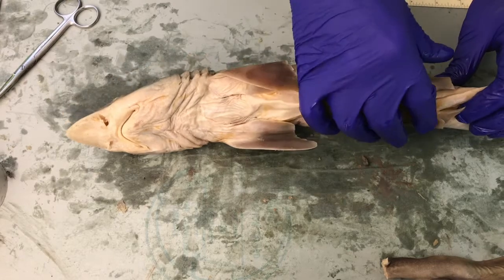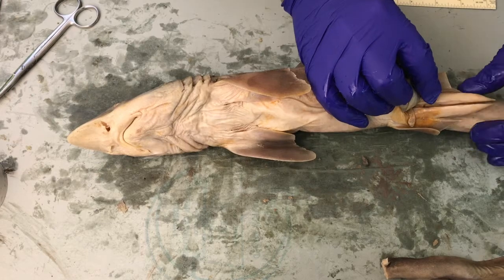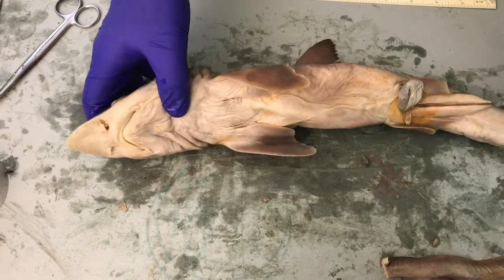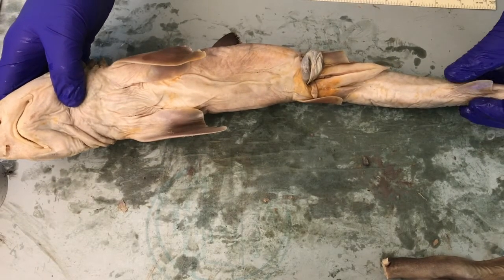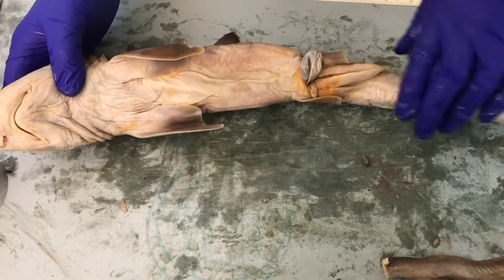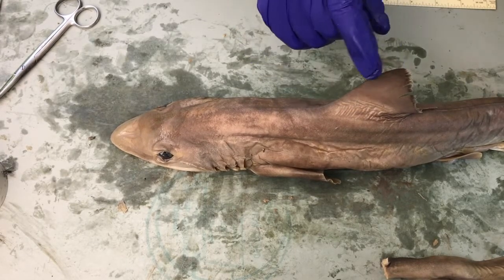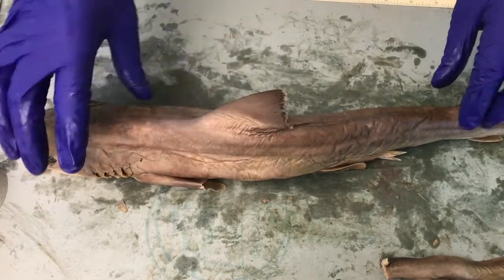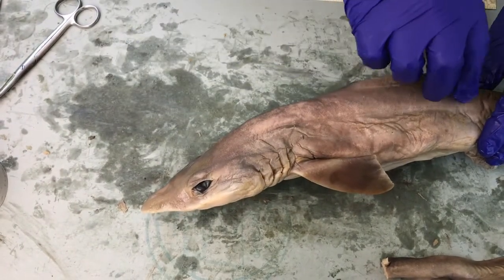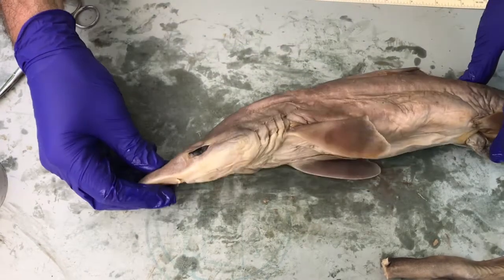These are modified pelvic fins into these really hard, tough structures called claspers. Those are found in the male. So this is a male shark. And this also has an anal fin here. The spiny dogfish that we get in Maine does not have an anal fin, and also has spines on the two dorsal fins. So there's spines on that. Spiny dogfish also tends to have spots, right, along the lateral line.